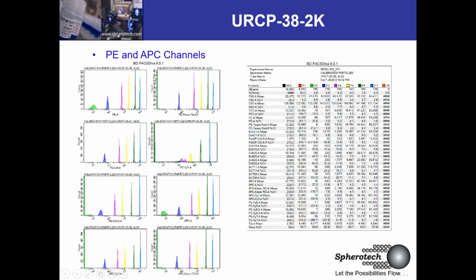Okay, so here are some examples, and I have run these various data. What you want to do is grab the mean and the CV, and really the mean for every single channel. The CVs, you'll notice, will decrease. 21, 8, 6, 5, down to 5. Oh, I like that peak. I want my CVs, 4.4, I really like that peak. Okay, enough about numbers. But we want to see these intensity values increase.